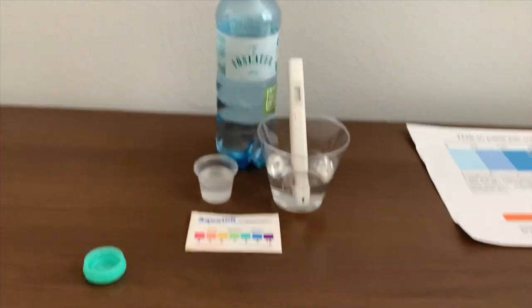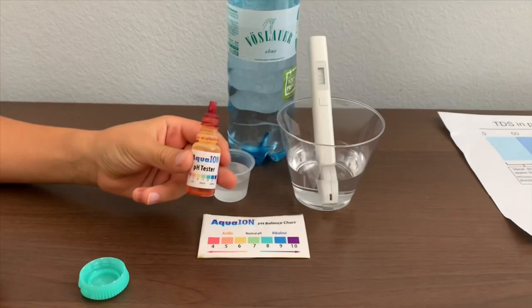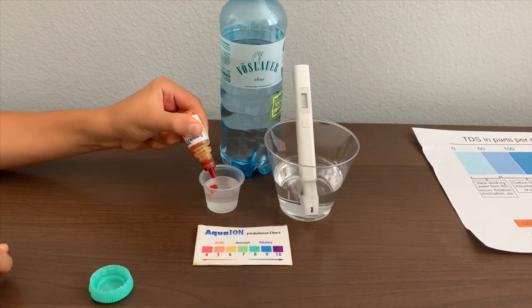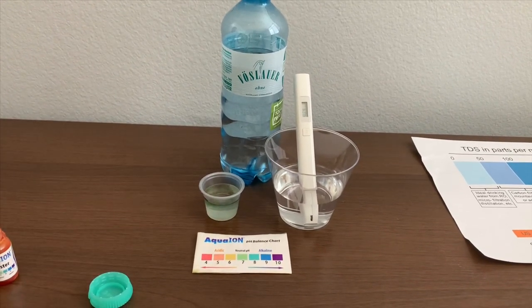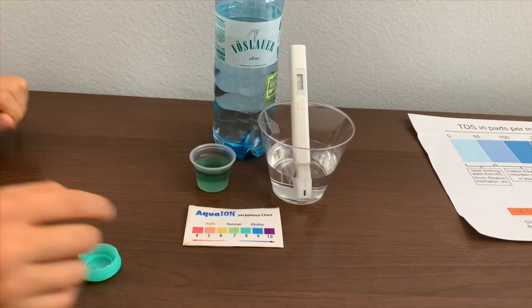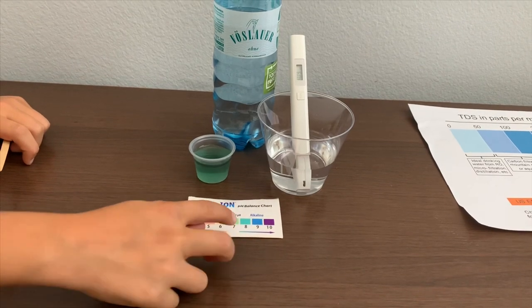Now let's test the pH level. If you want to buy this pH Tester, check the link down below. I'm going to do two drops. Let's stir it for a better result. I give this an 8 — this is alkaline neutral pH.